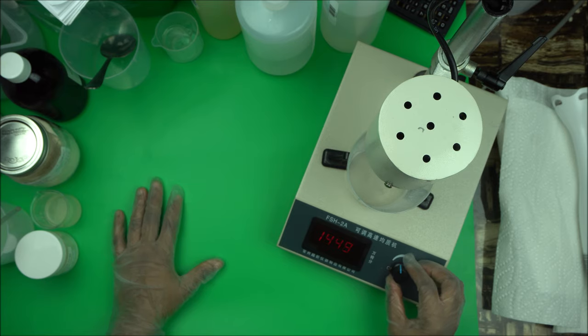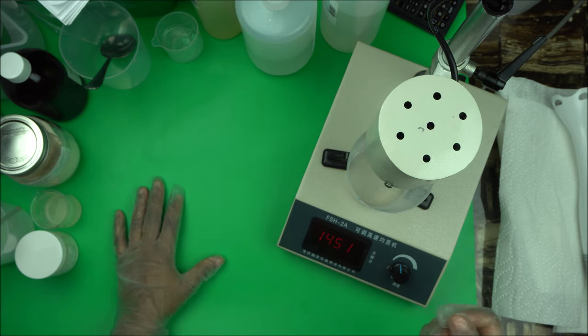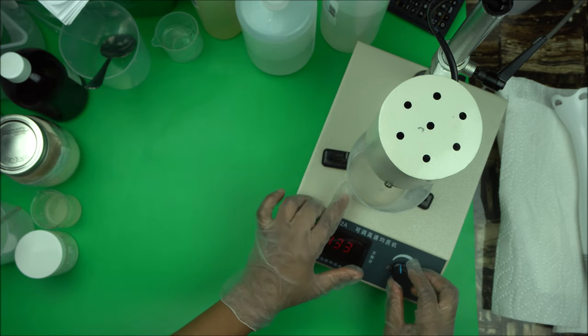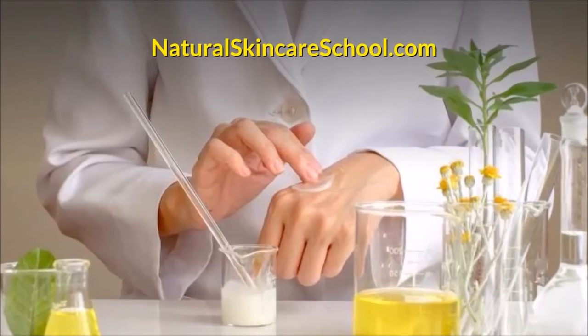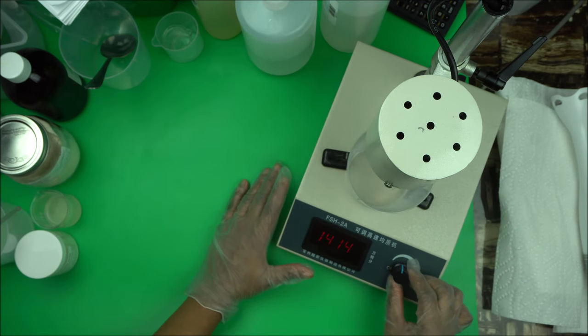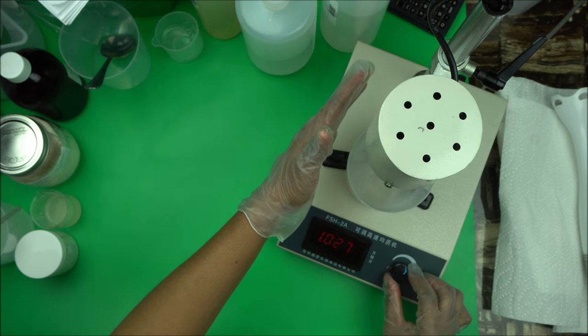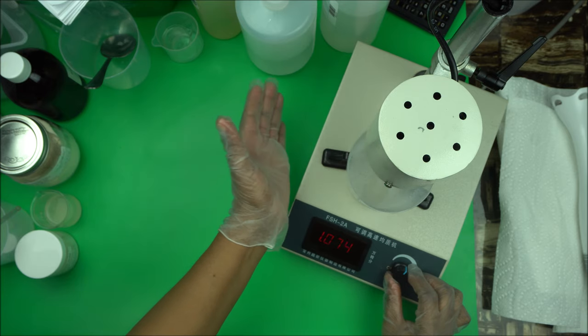A homogenizer will homogenize the particles and turn the particles into smaller sizes, but if you want to avoid that, just use it at a low setting. If you now want to use it as the proper homogenizer, you can now increase the speed as you can hear right now.